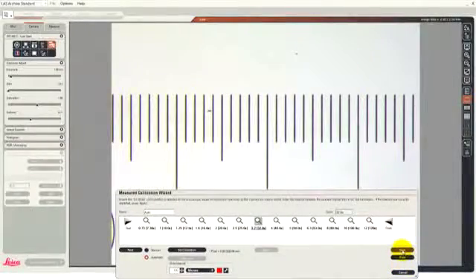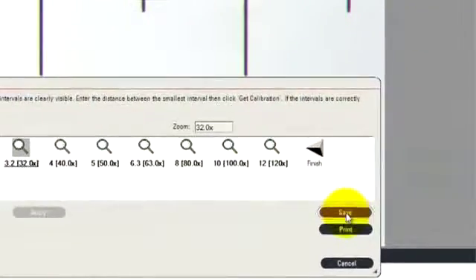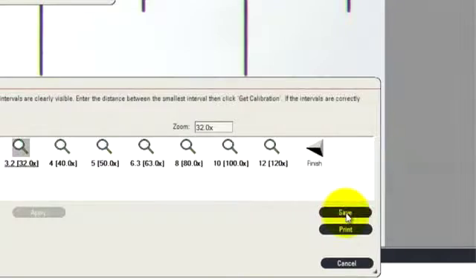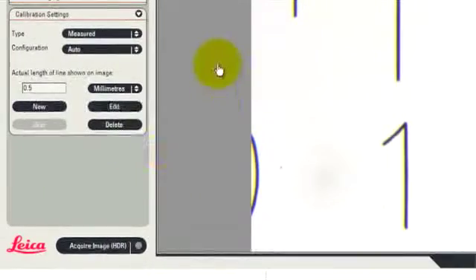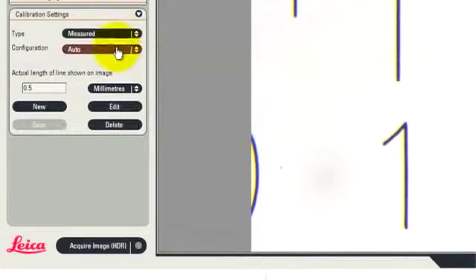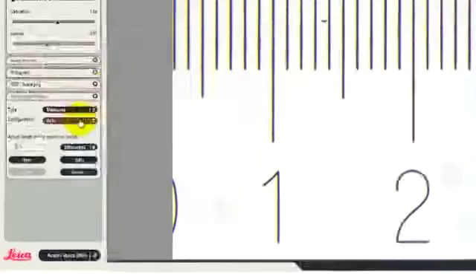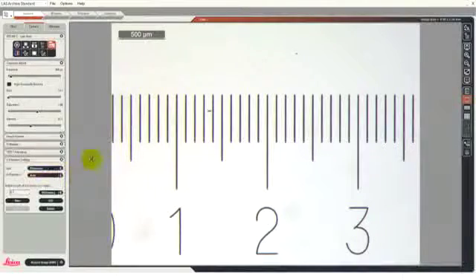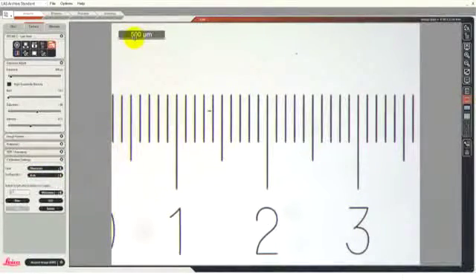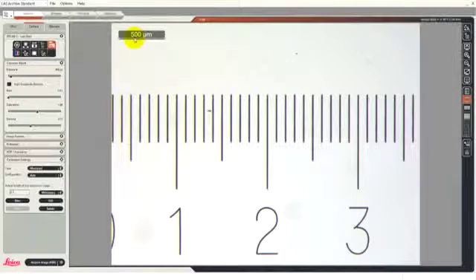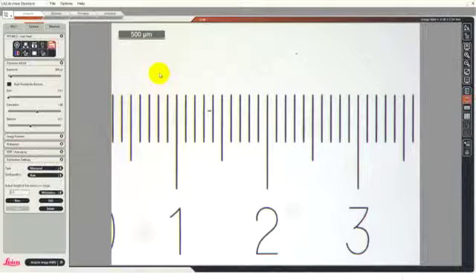At this stage, it's appropriate to save all those calibration values. We now see that we've got the measured calibration selected with the auto configuration, which is the one that I chose. Now we know that whenever we show a scale bar, it matches us exactly to the zoom values of the microscope as we can measure.